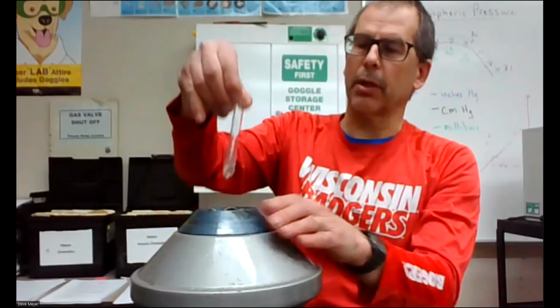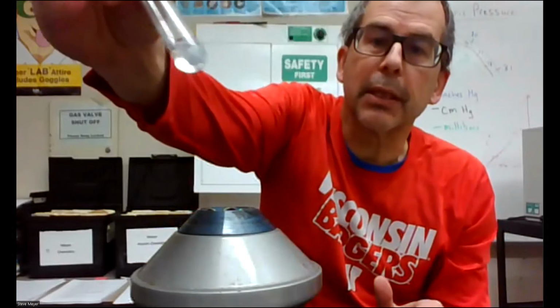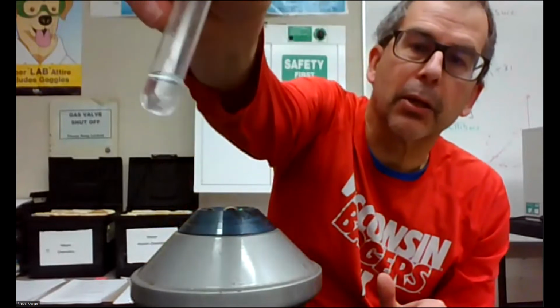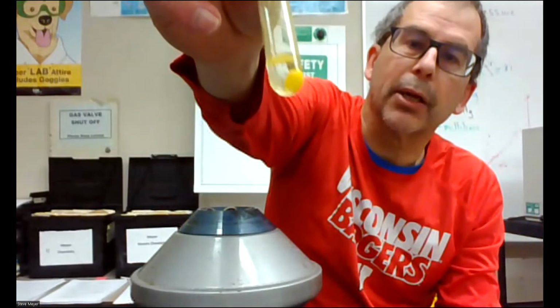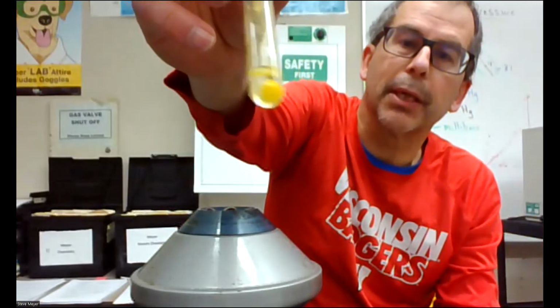So we give it a little spin and slowly stop it. I take a look, and I don't know if you can see it, but it looks like a clear solution with a white solid on the bottom. So that's separated out. This was the third reaction: it's clear, but there's the yellow precipitate on the bottom. You can see how that separated out completely.